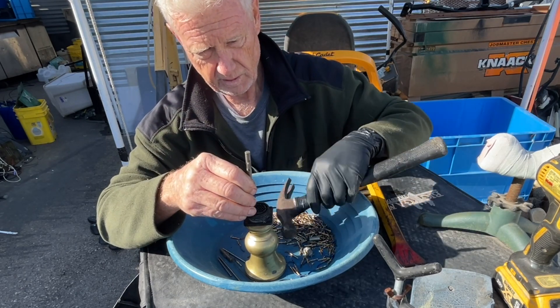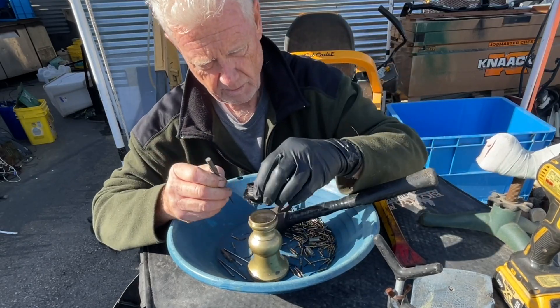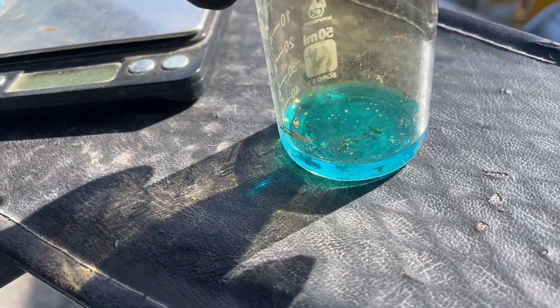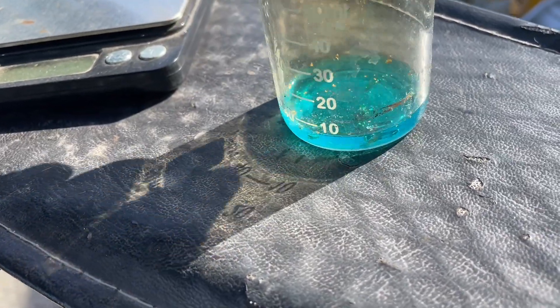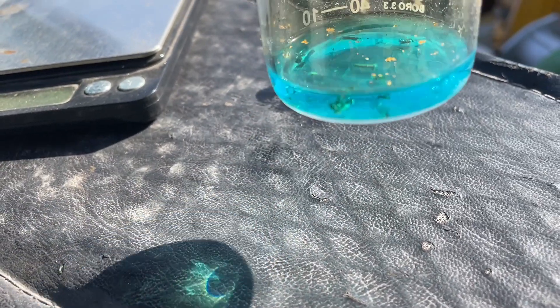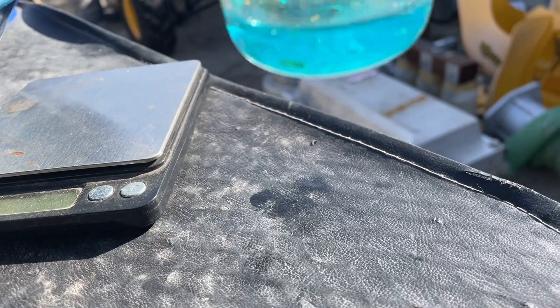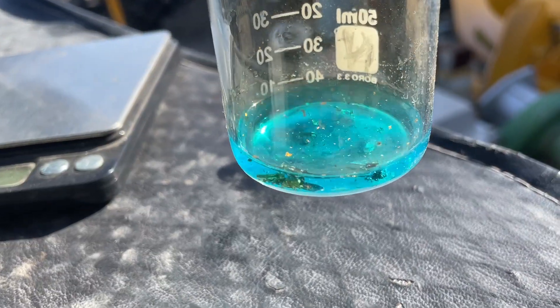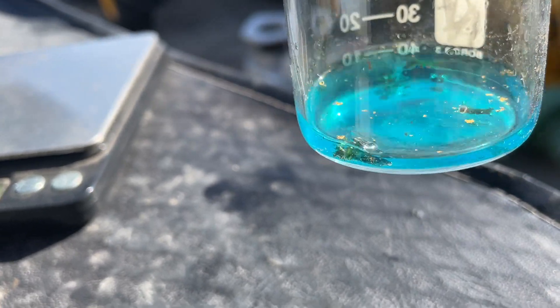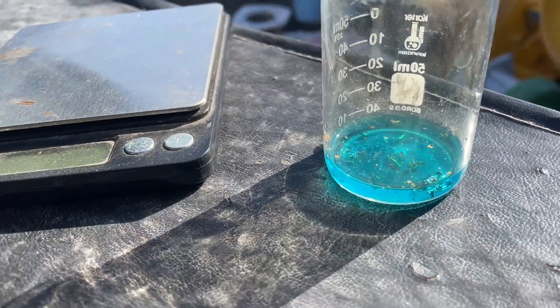I took one pin and put it in the beaker with a little bit of water and a shot of nitric. You can see all the gold floating in there, and that stainless steel part is right there — it's not being eaten up at all.